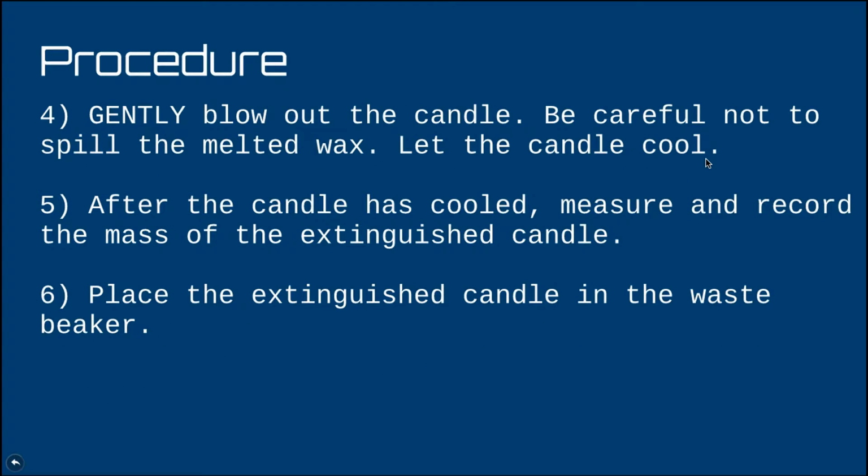Now, once your 5 minutes are up, please blow gently on the candle to blow it out. Again, don't let that wax spill because it's just going to make a mess for us to clean up. Just let it stand for about a minute. Let the candle cool. Make sure that the wax is solid again, and it's not going to be spilling everywhere. And then at that point, you can take your candle, put it back on the scale, and measure the new weight of it.